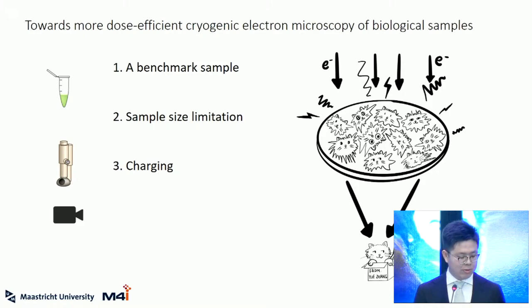And we also integrate a detector, a hybrid pixel detector, to the current cryo-EM workflow. And we discuss a few alternative strategies for the current defocus phase contrast imaging. And these are the five chapters of my thesis.